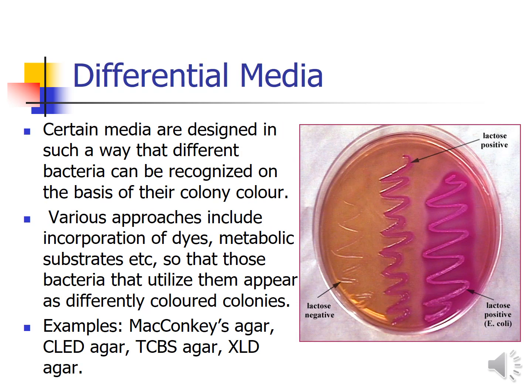Differential media. These media are designed in such a way that they differentiate bacteria based upon certain properties. For example, MacConkey agar will differentiate lactose fermenting colonies from non-lactose fermenting colonies. Various approaches include incorporation of dyes and metabolic substances, and the bacteria that utilize them appear as differently colored colonies. As I told you, MacConkey agar is an example. Other examples are CLED, TCBS, and XLD.